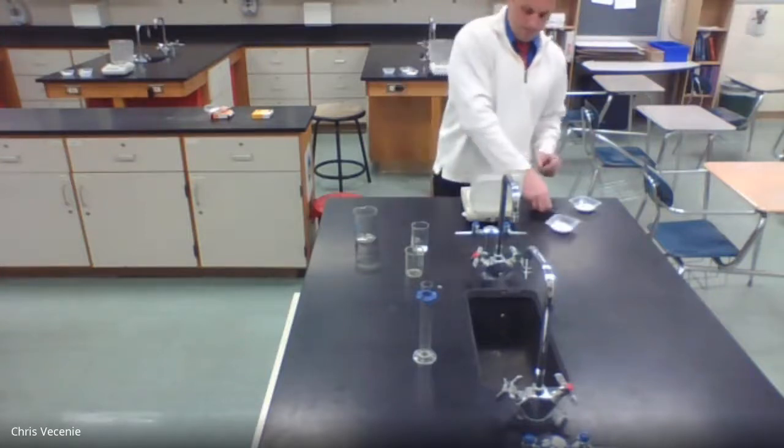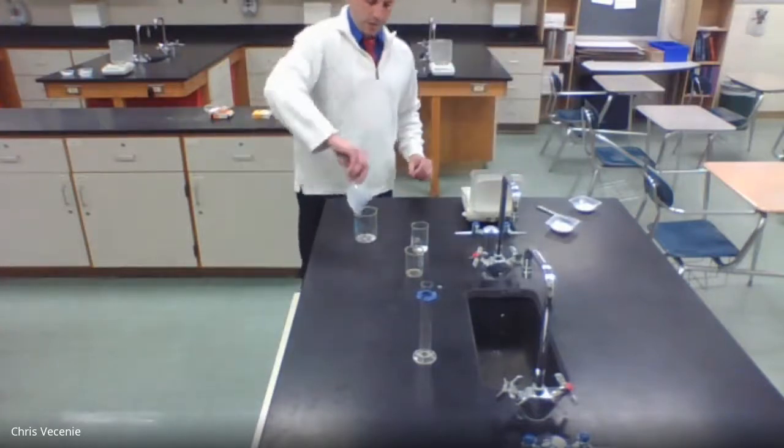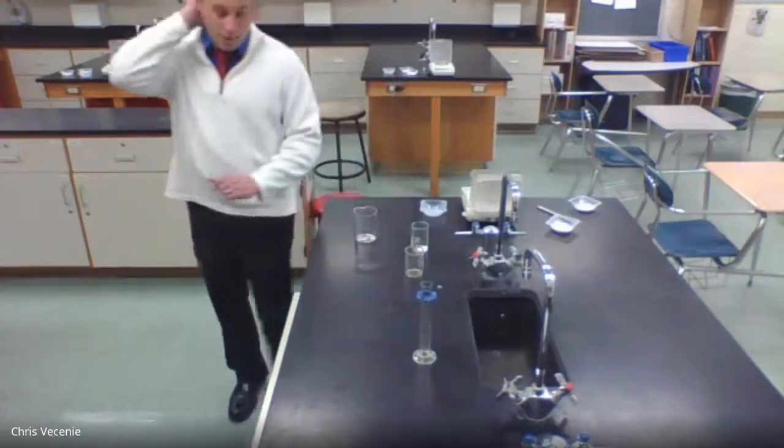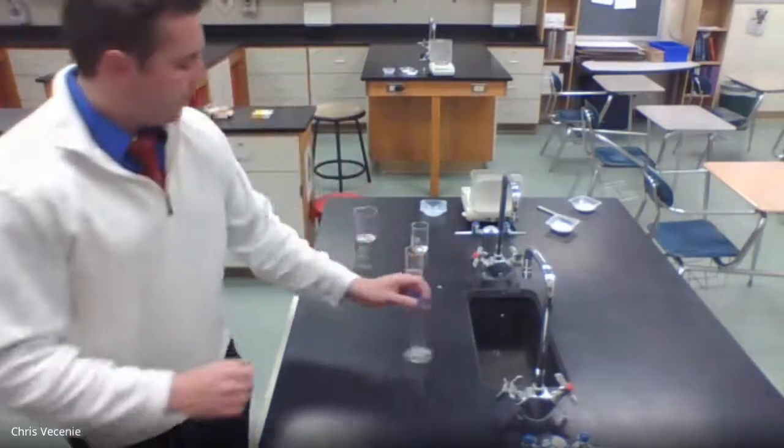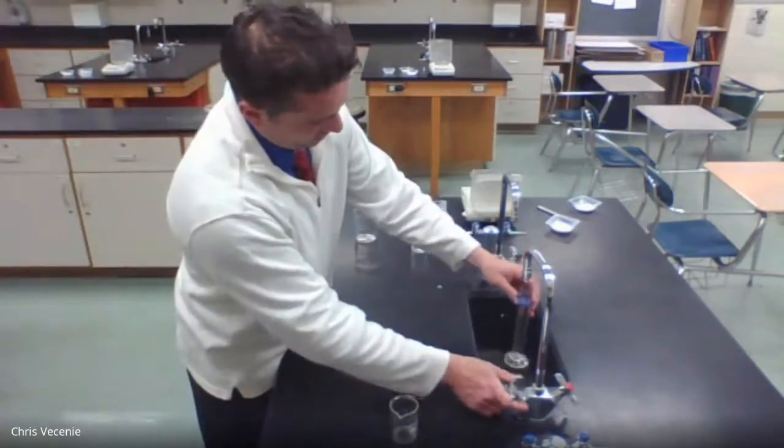And 0.75. All right, so that's going to go into my bigger dish. Now it tells me to take 30 milliliters of water and dissolve each of these substances. So I'm going to use my grad cylinder.